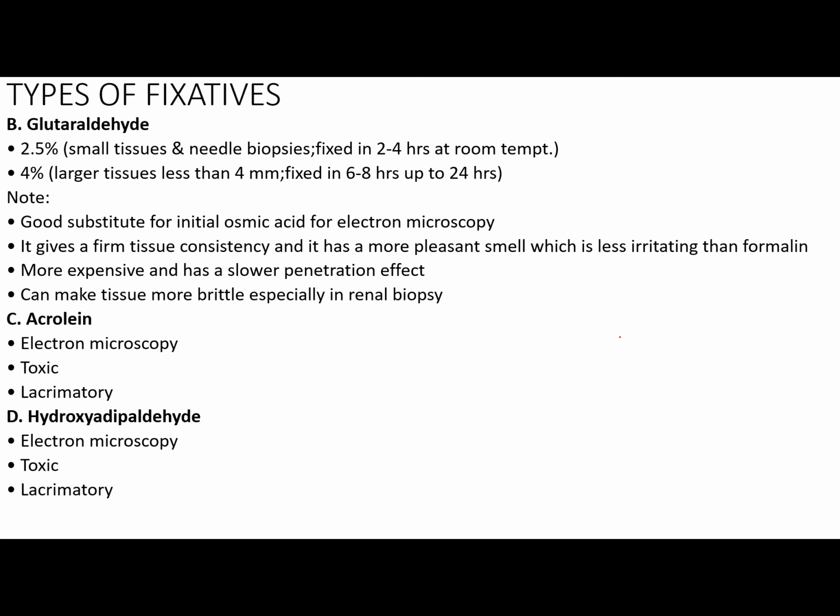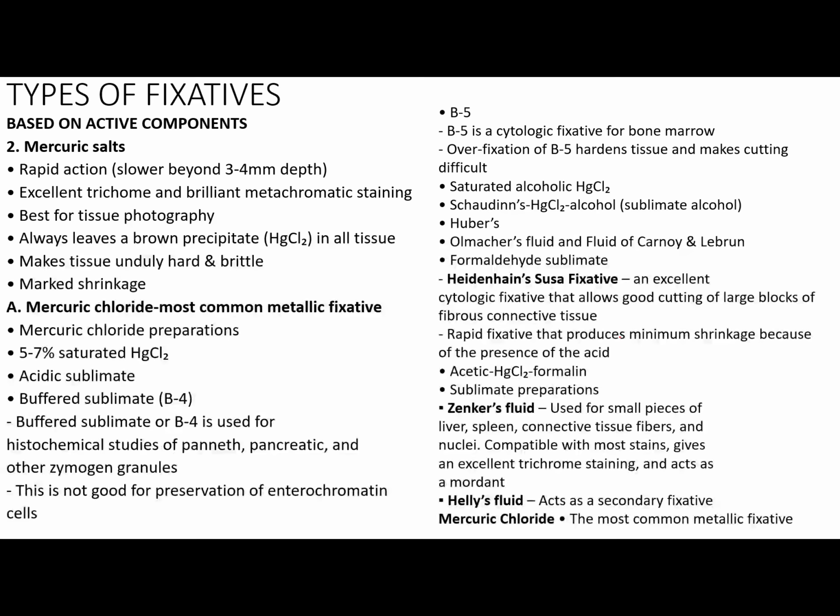Ang problema lang sa glutaraldehyde class, mas mahal siya, mas mabagal siya mag-penetrate. Can make tissue more brittle, especially in renal biopsy. Then another group is your acrolein and hydroxyadipaldehyde. Si acrolein class at si hydroxyadipaldehyde nyo, they are both used for electron microscopy. They are toxic and they are lacrimatory. Then, based on active component, tapos na tayo sa aldehyde.